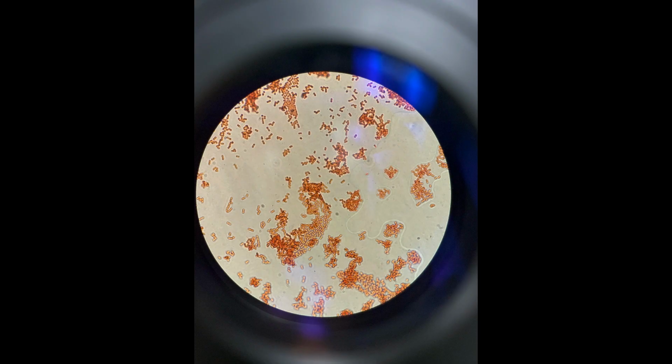In this image, we have our direct stain of Enterococcus using safranin, which should have stained them pink. And as we can see, we do have nice pink coccus-shaped bacterium. Enterococcus is closely related to Streptococcus, which tend to grow in chains of cocci. And so you can see some of these, we've got those chains of cocci that are growing. But again, when you do a direct stain using safranin, this is the type of result you would expect to see. All of your cells should be a nice pink color.